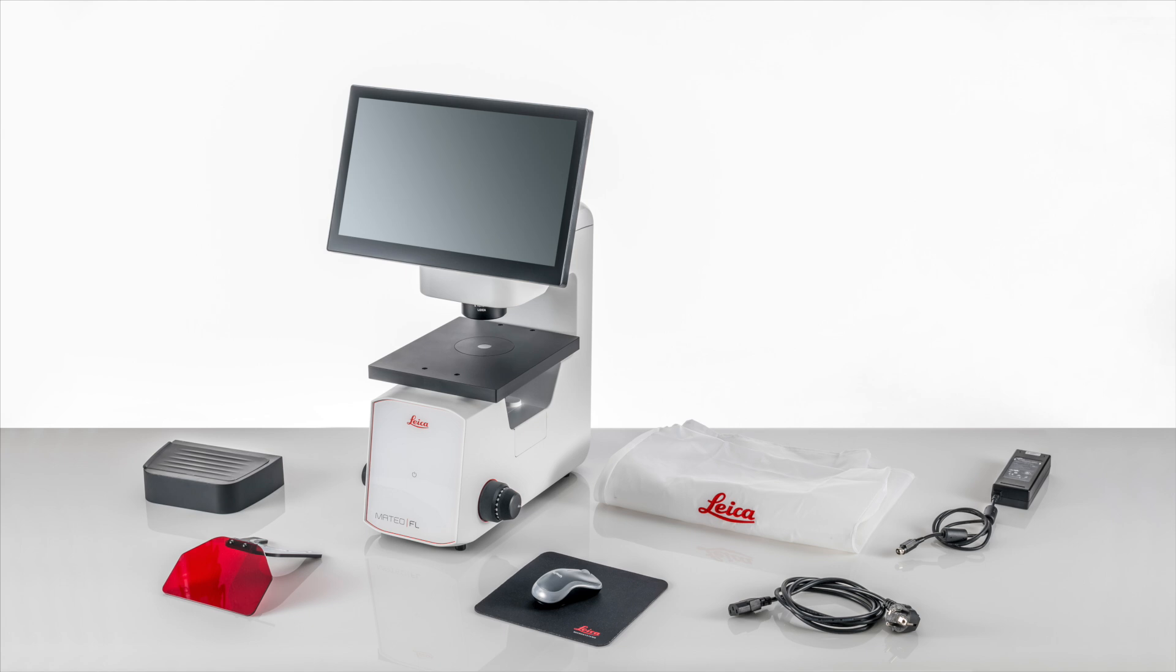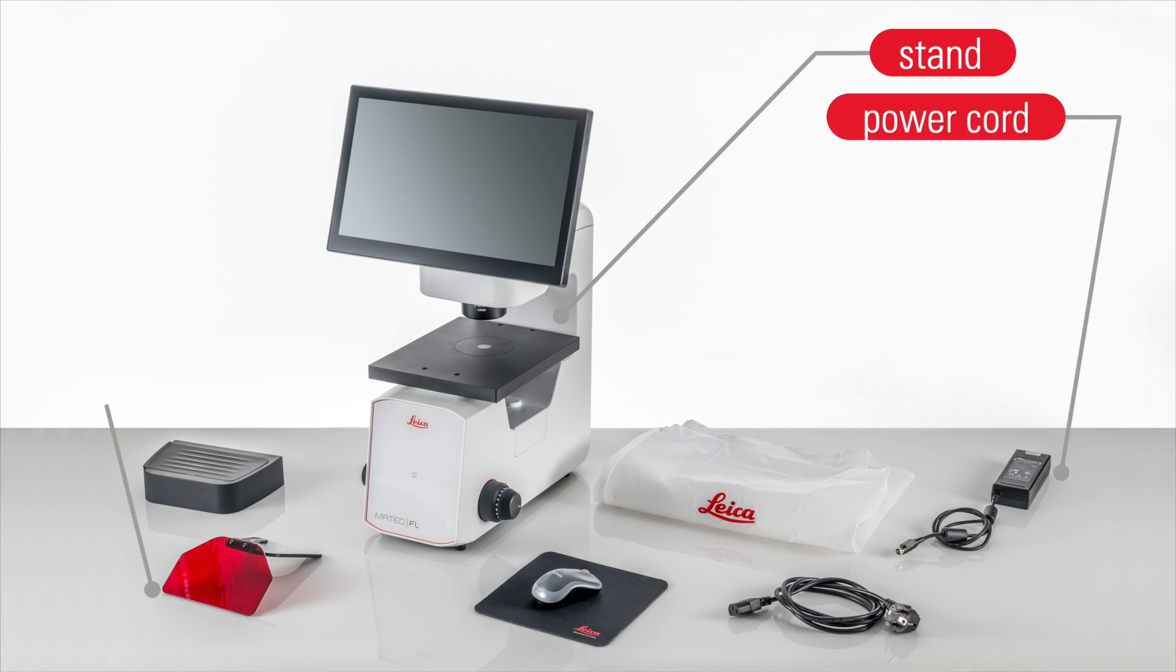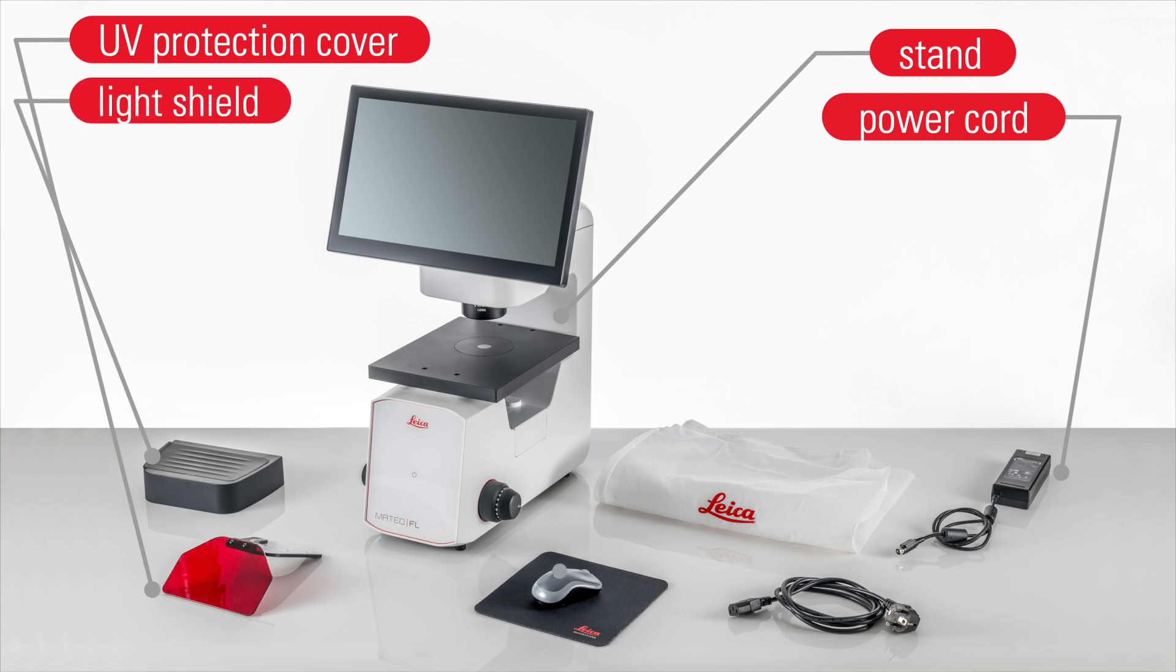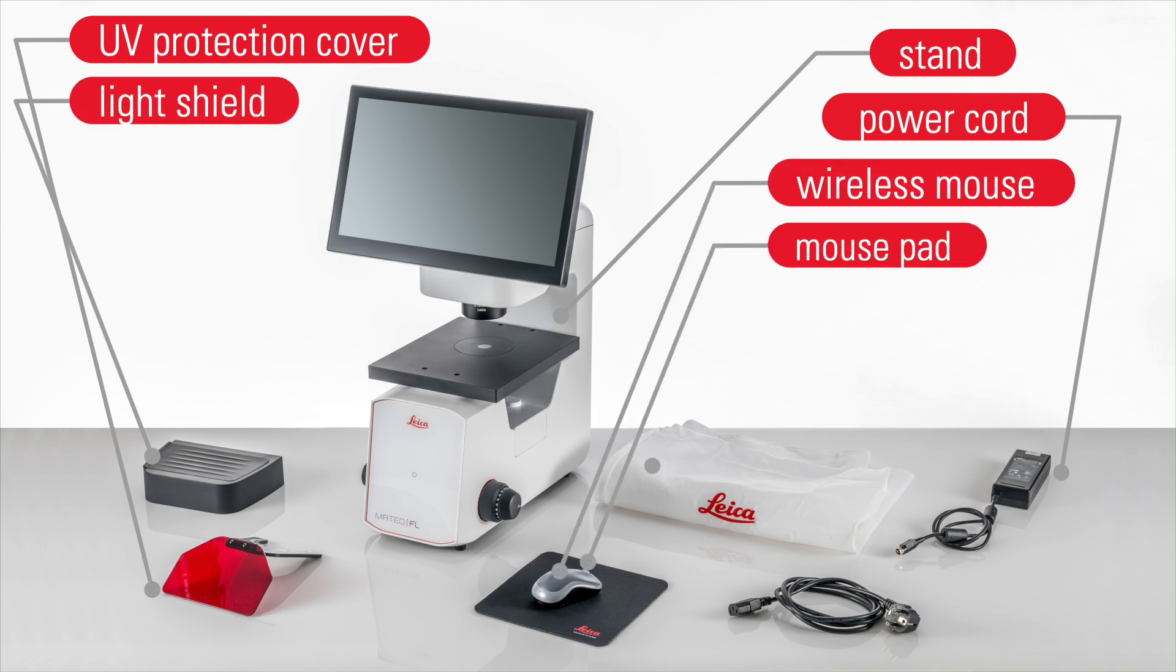Inside the box, you will find the following components: a stand with an integrated monitor, condenser, cameras, power cord, UV protection cover, light shield, wireless mouse, mouse pad and dust cover.